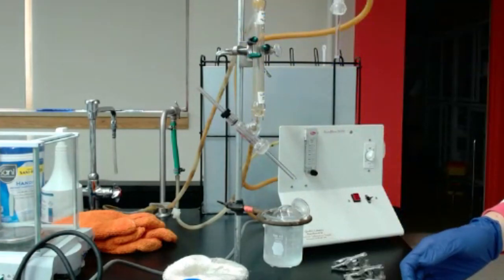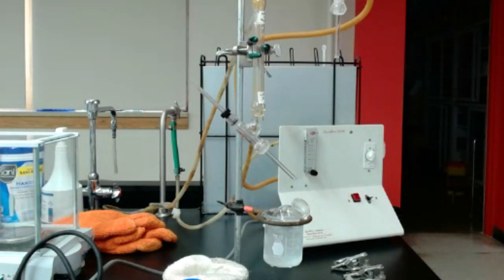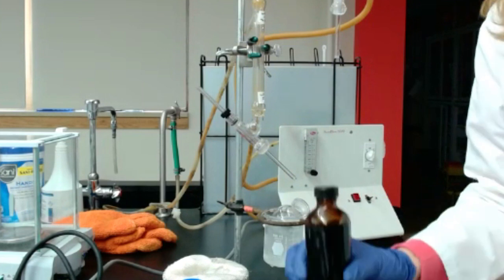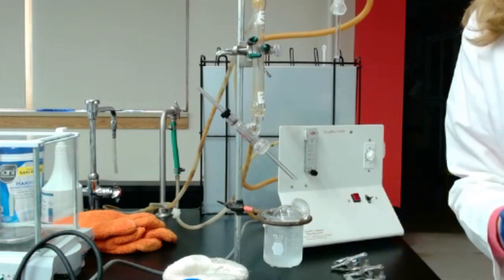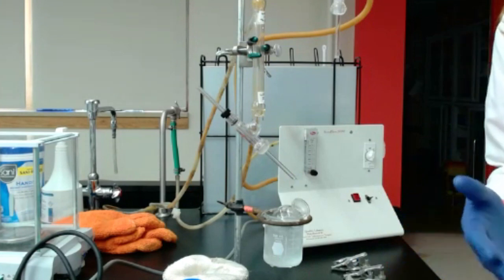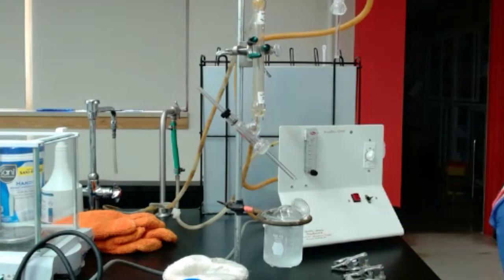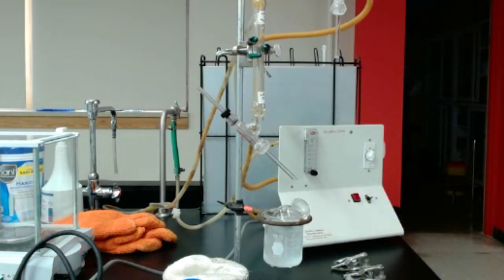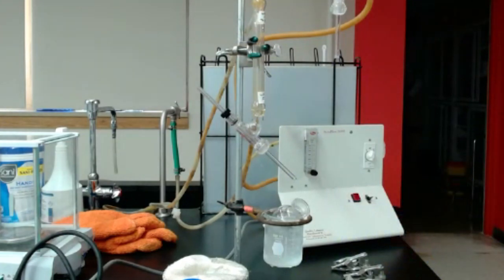So then you will need your wine sample. If you have the wine that we shipped to you last week, you can reuse it. Know that it has been open for a week now, even more maybe, so the concentration might be a little bit low. Otherwise, you can use the Pinot Noir that you have, or another wine that you have.